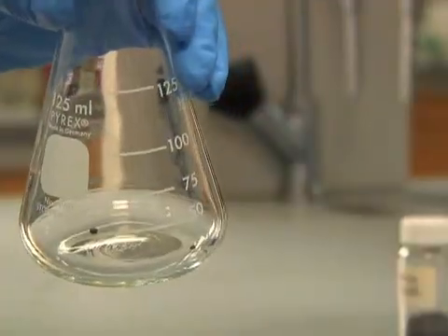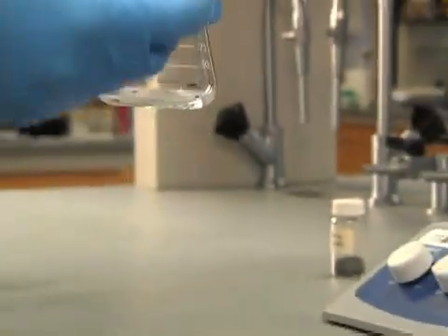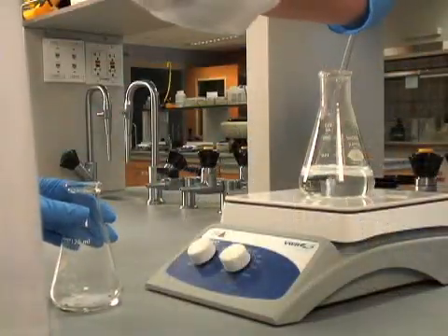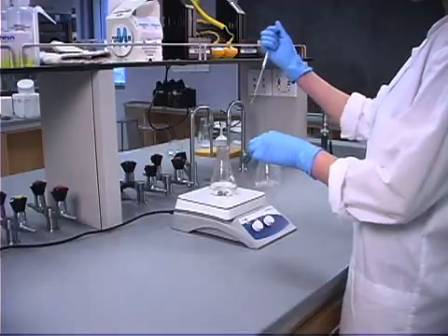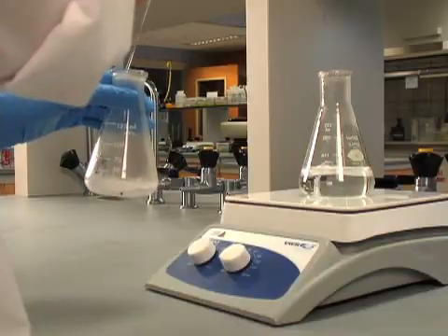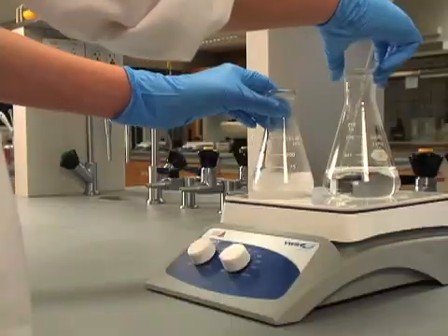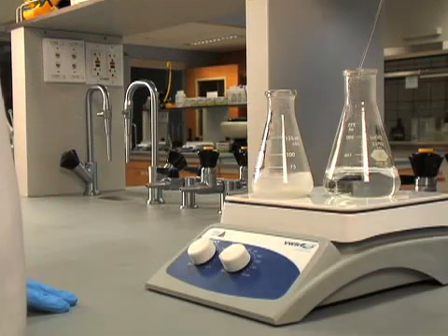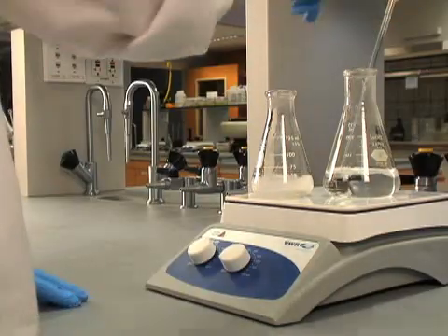In this step, we are trying to dissolve the compound in a minimal amount of hot solvent. We will add the hot solvent in small portions to our flask. After each addition, swirl the flask and bring it to a boil before adding more. We only want to add enough hot solvent to fully dissolve our compound.